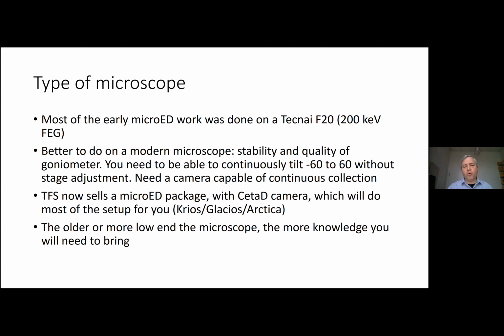I'd say that the older or more low end the microscope, the more knowledge you'll need to bring, because you'll have to do more calibrations. You'll have to get it working. You'll have to make sure it's all working. So I would say the easiest thing would be a modern mid-level to high-level microscope. So Glacios or Arctica, or even Krios would be good. Those are the ones I would have experience with.